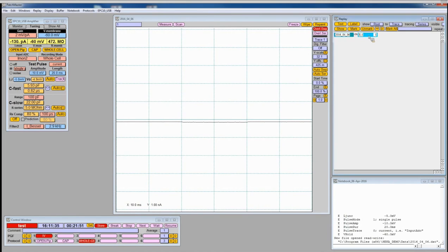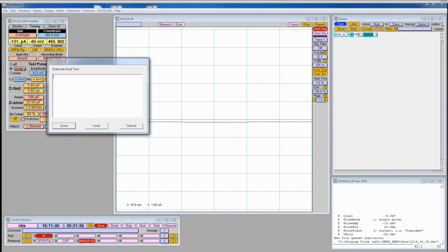It's highlighted right now. Yeah, when you click on it, it highlights it. Highlighted is in light blue. And now we can press on text and we can enter any text we want, a whole paragraph if you want. I would use this feature to explain to yourself basically why you did these experiments, what you want to do, basically your project.